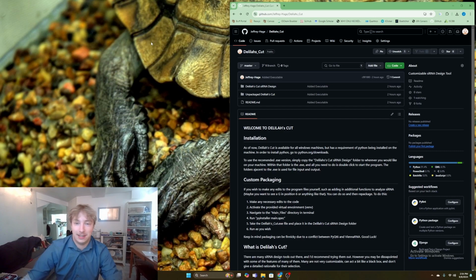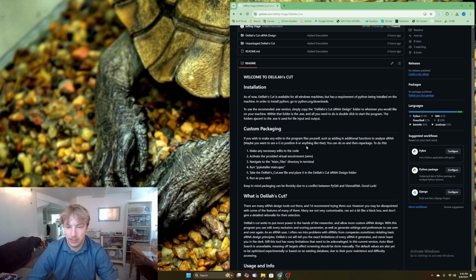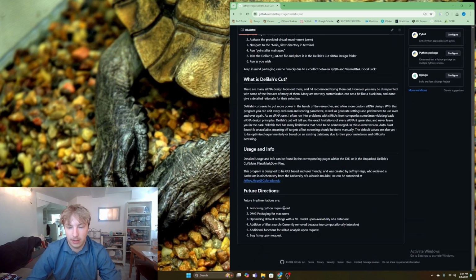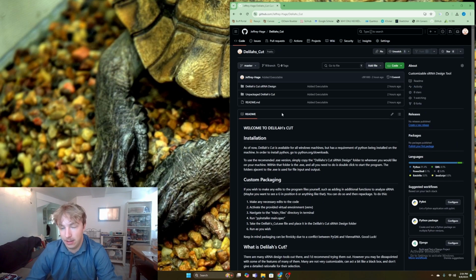And with that being said, let's go over the installation. You can see everything you really need to know on this page right here, which is the GitHub for me and this program, and you can see all this information here that I won't go through. And then this is the contact information if you have any questions. To install it, it's very simple, and all you really need is this folder right here if you're going to be running the basic use case.